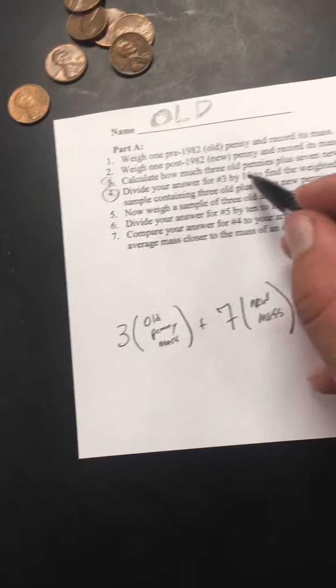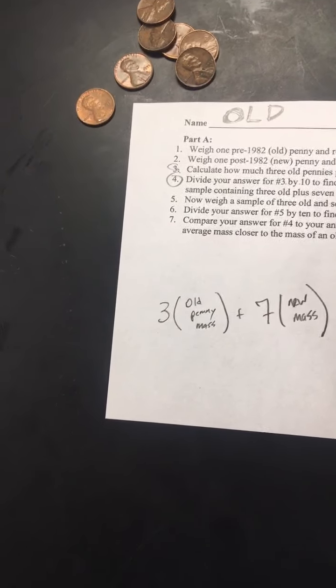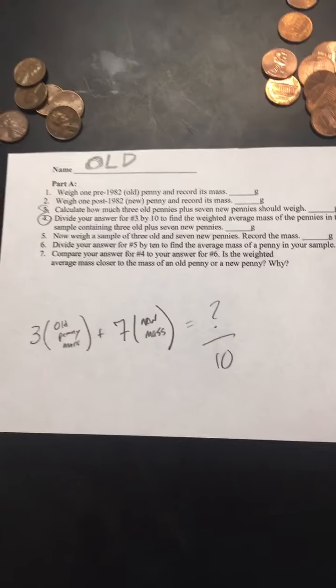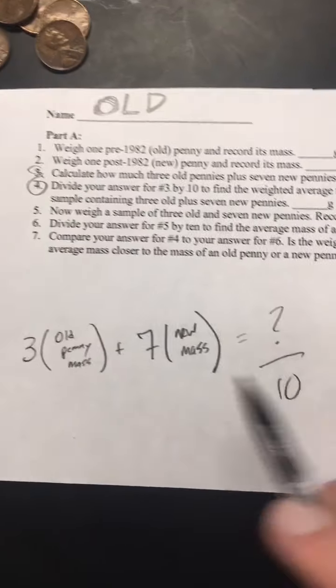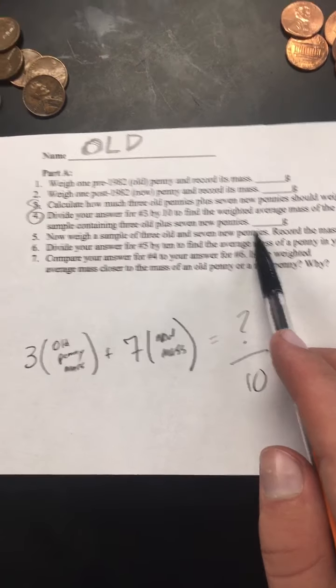Number 4 says divide your answer for number 3 by 10. Whatever your answer is, divide it by 10. Number 5 says now weigh a sample of 3 old and 7 new pennies.